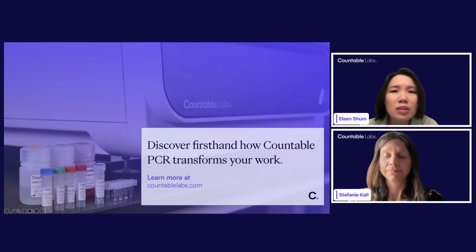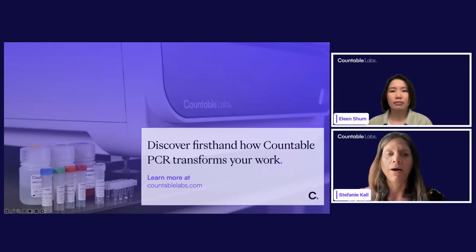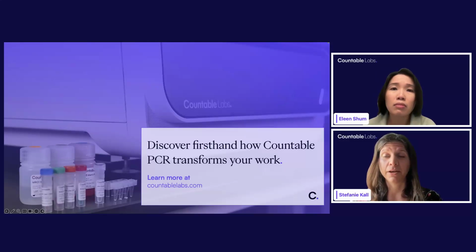Okay, so Steph, what's the minimum and maximum amount of DNA you can load per reaction? Great question. Like I said, we're analyzing the whole tube. There's a lot of room volume-wise for DNA, so you can put up to 35 microliters of your target DNA. If you're working with a sample that's got really dilute target, you can load up to 1 microgram of DNA as well.